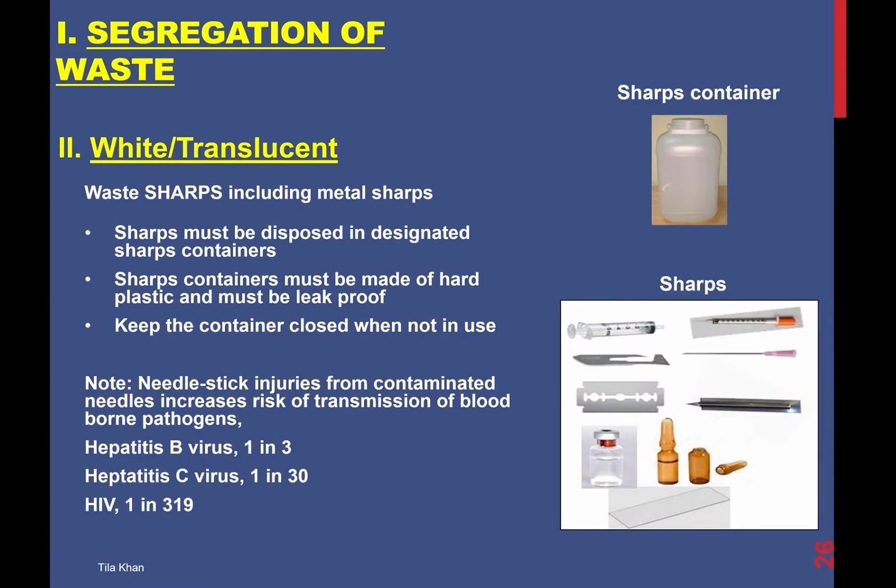Here in IIT Kharagpur, we are not doing the red category. Red is for recyclable waste, and a major chunk of our research waste is falling under the yellow category, so we will not be dealing with red waste. Coming directly to white. So what is white waste?